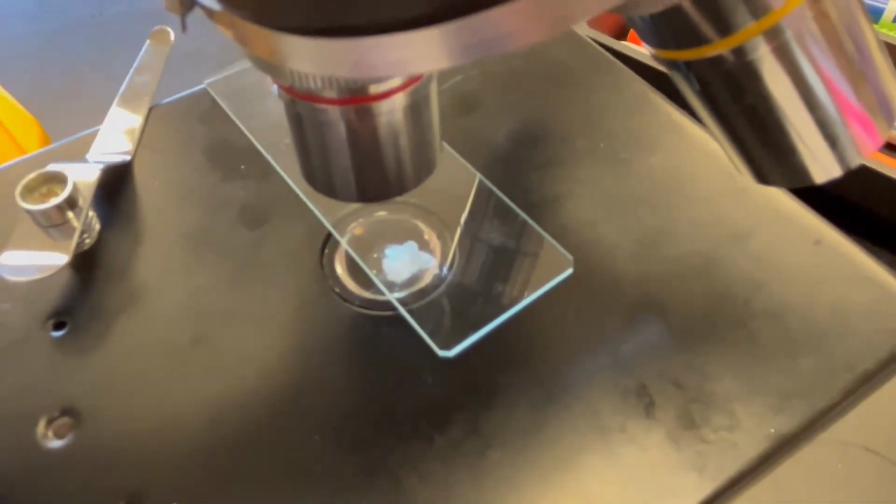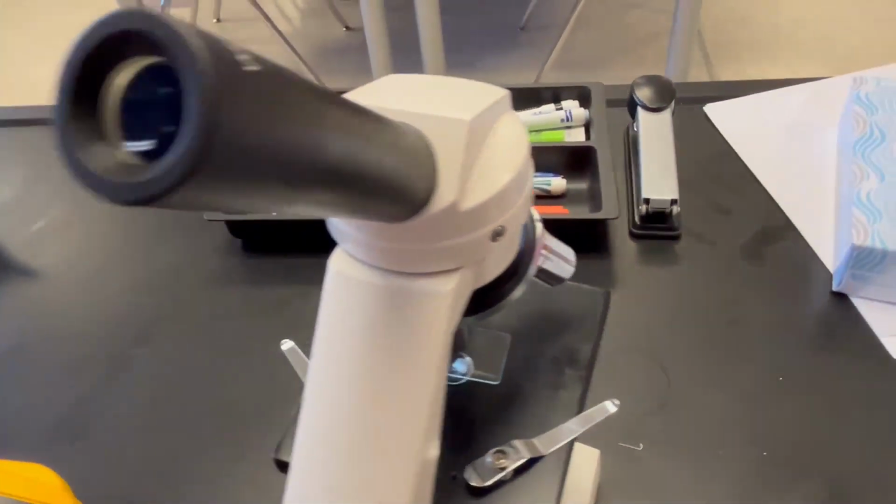So you can see here that it's starting to form crystals, and then when you look through the microscope, this is what students will see.